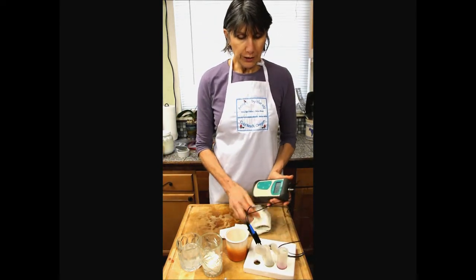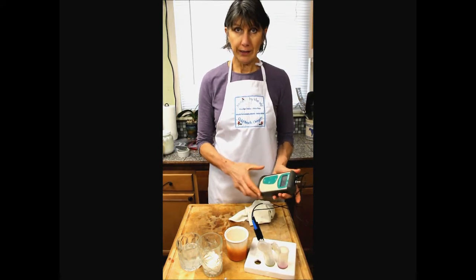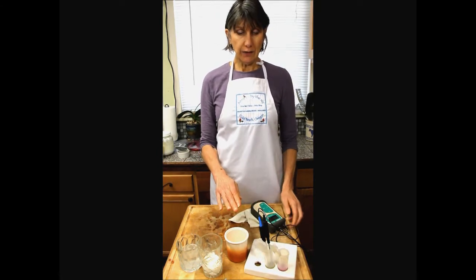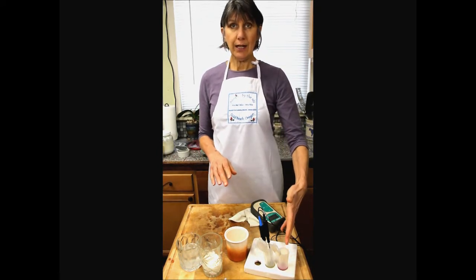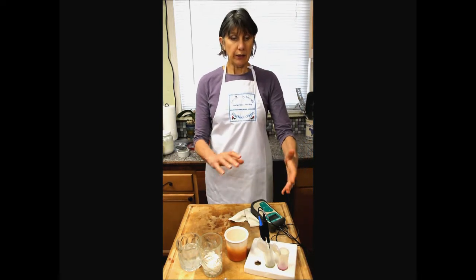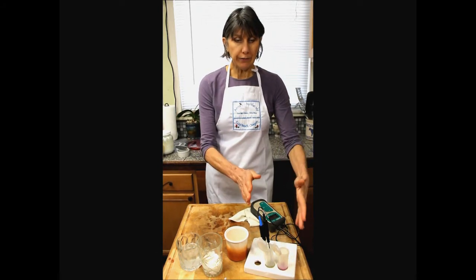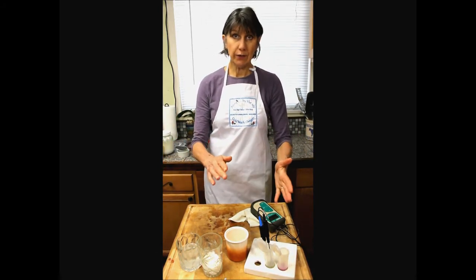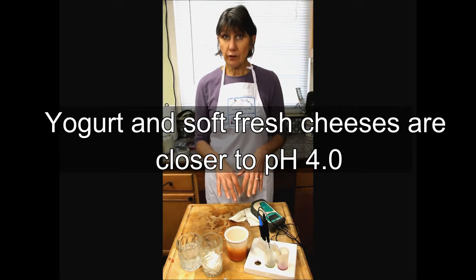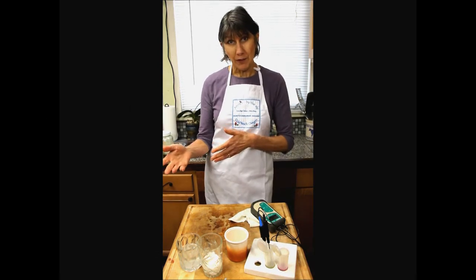So before I check these cheeses, I'm going to verify that, stored in the 7 solution, my electrode is still reading correctly on the meter. And it is. If you're making cheese and you're checking the pH toward the end of the process when the pH is lower, you're going to be fine storing it in the 4 solution. Wherever the closest number is to where you're working, that's what you can store it in. I've never used storage solutions. You just don't need it. You can use them if you want, though.